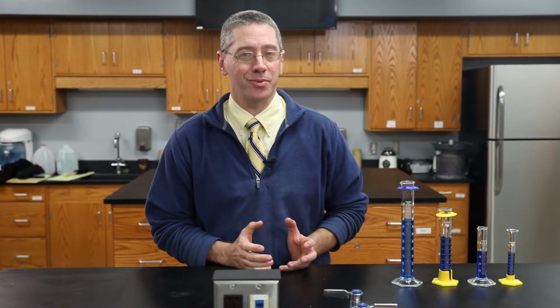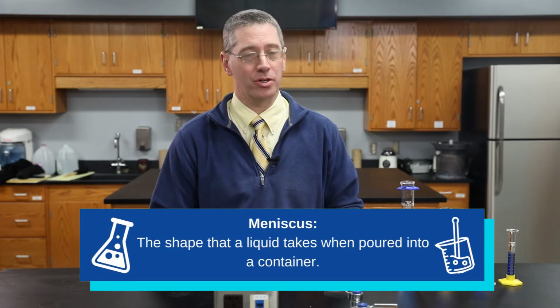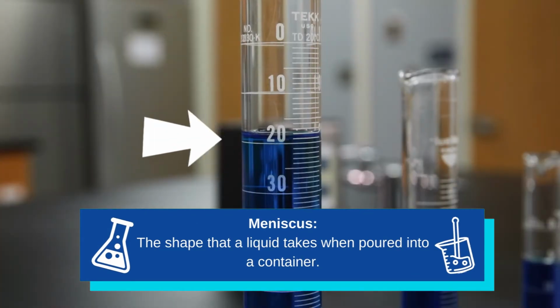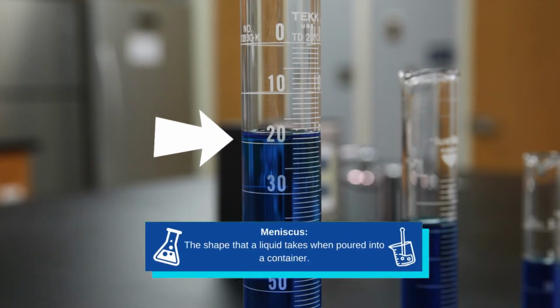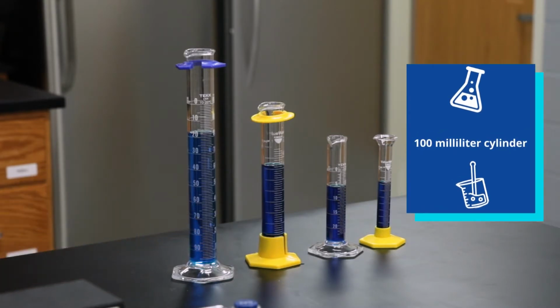When you're measuring liquids with a graduated cylinder, it's important that you read from the meniscus. When you look at the liquid level in the cylinder, it's going to make a downward curve, and you want to read from the bottom of that curve. And in this larger cylinder, each little line that you see is 1 milliliter apart.